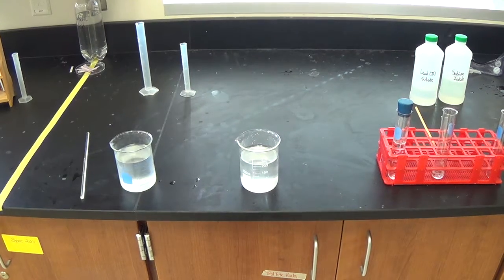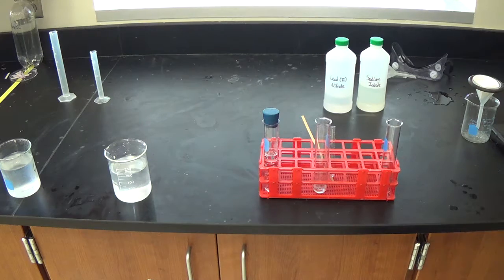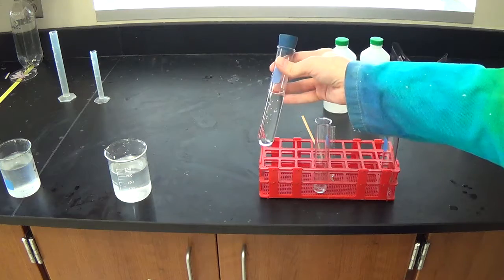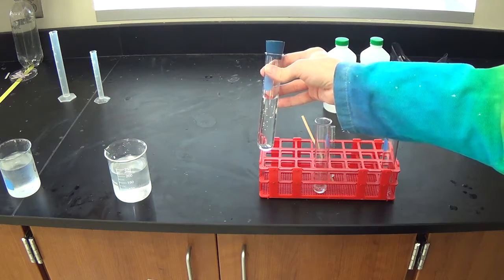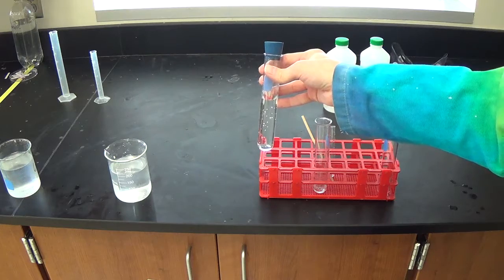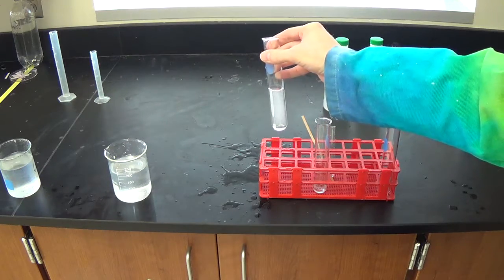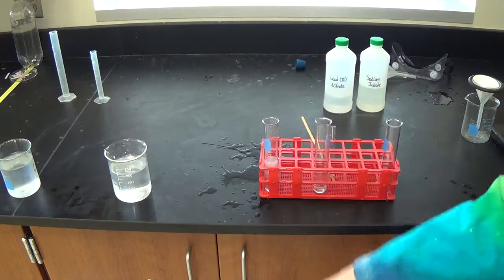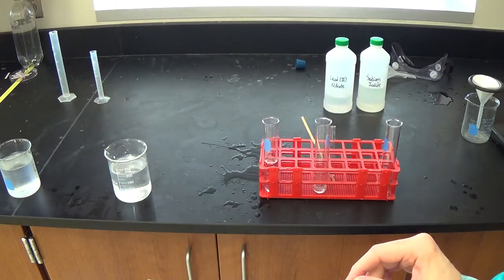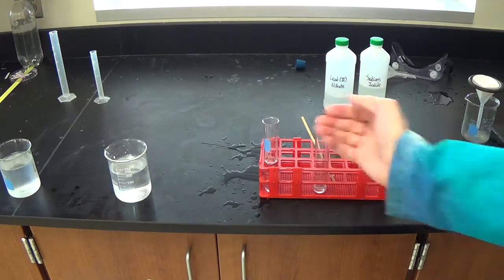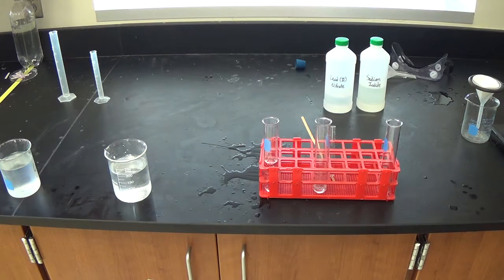Let's move on to Reaction 3. In Reaction 3, I've got some carbonic acid in this test tube with the stopper. This carbonic acid, given enough time, will decompose. It will look really boring while you wait for it to decompose. We can speed up the rate of the decomposition by adding some activation energy. That is, we're going to shake it. Shaking is all that's needed to add enough activation energy to get this to happen faster. I'm going to shake the carbonic acid. During the decomposition, a gas must have formed that built up pressure to pop off that stopper. We're starting with carbonic acid and one of the products must have been a gas to build up pressure and pop the stopper off. That was Reaction 3.